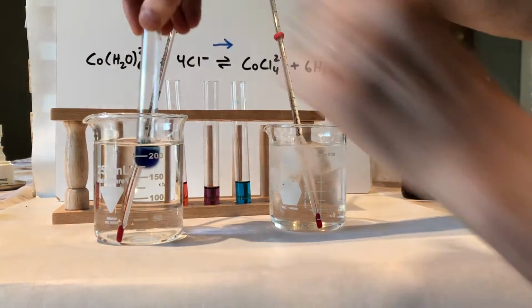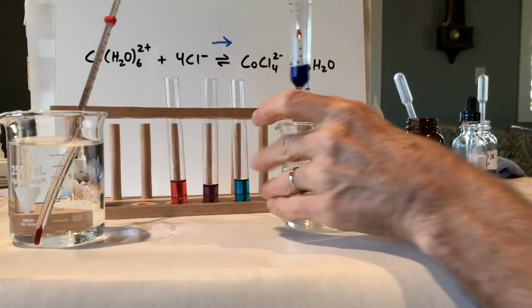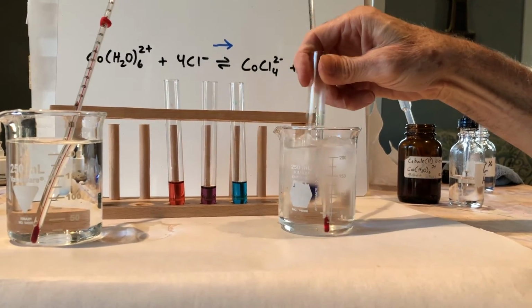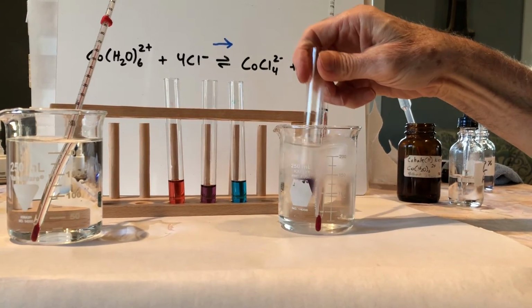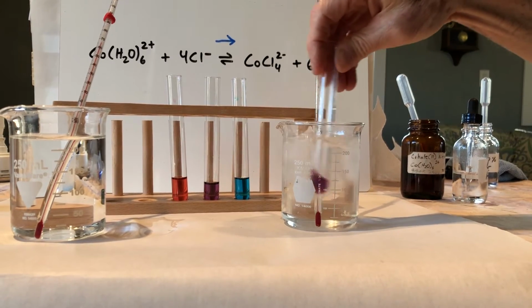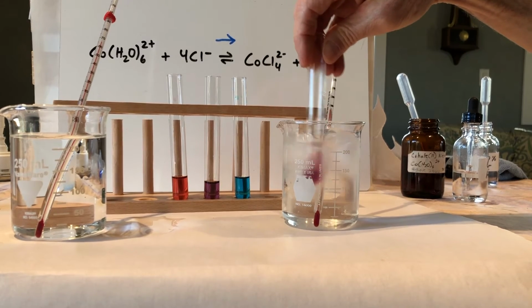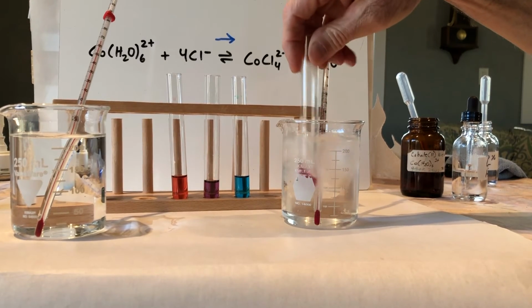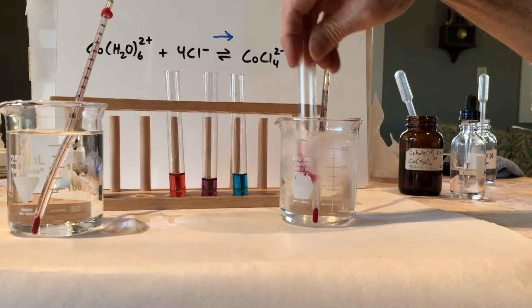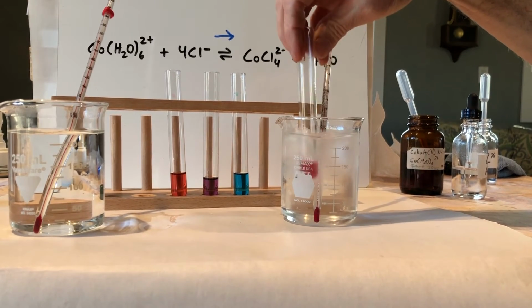And then, without changing this, now let's try a cold water bath. And again, what we're looking for is, does the solution get more pink or does it get more blue? And then ultimately, what does that tell us about the reaction in terms of, is it endothermic or exothermic? And we have to be a little patient with the heat transfer, heat flowing out of the solution into the cold water bath.